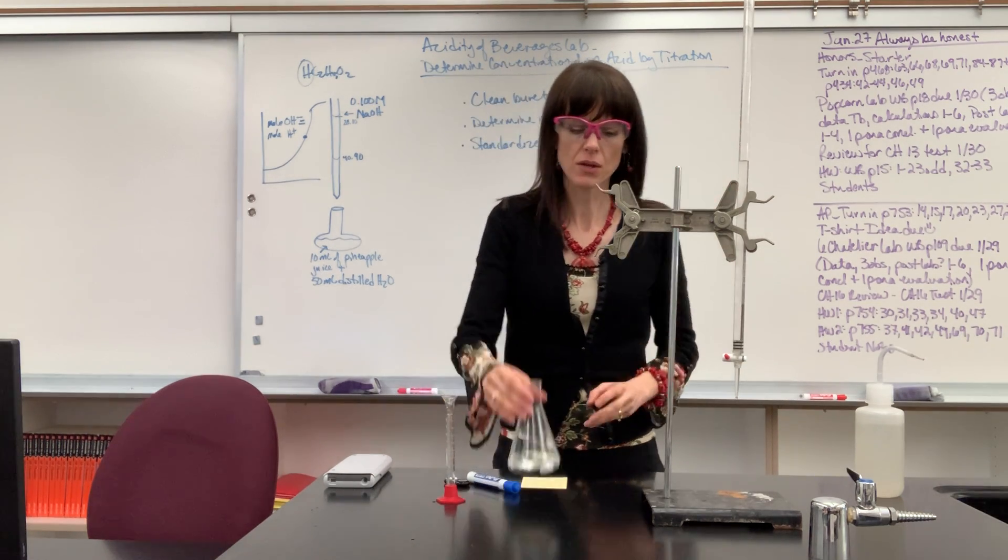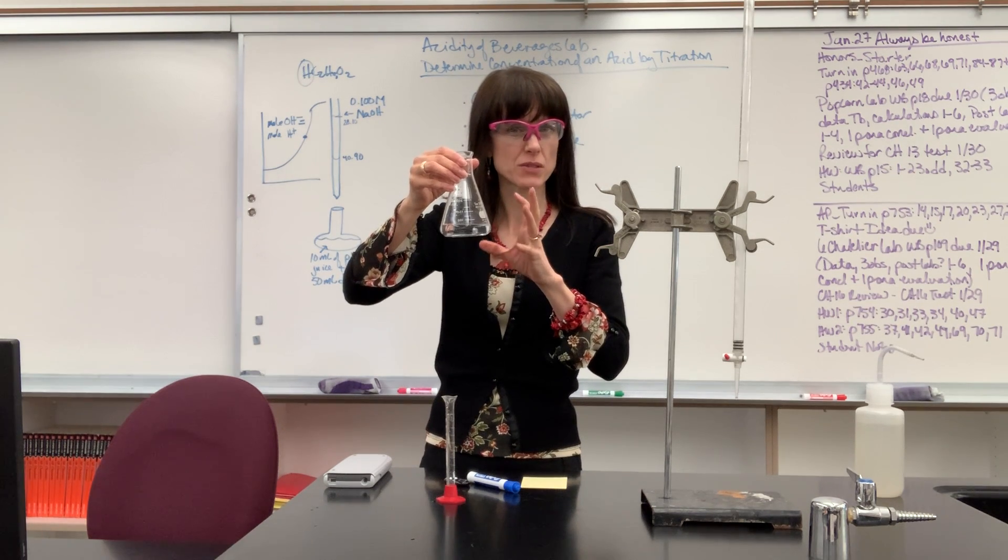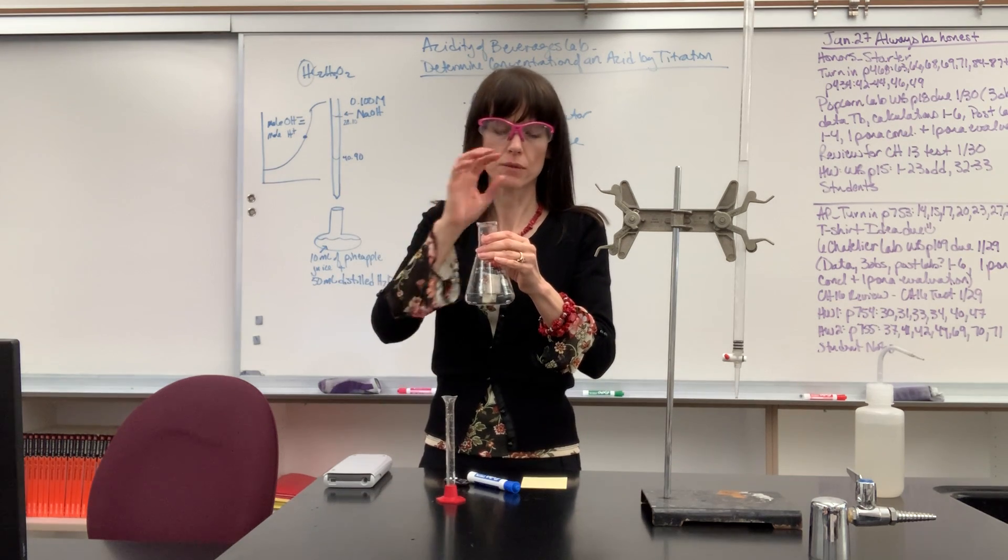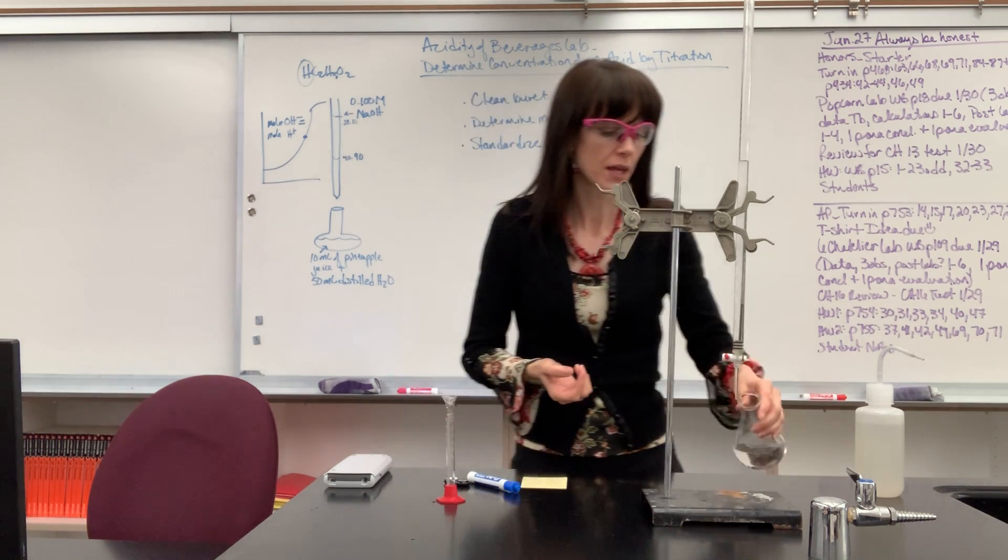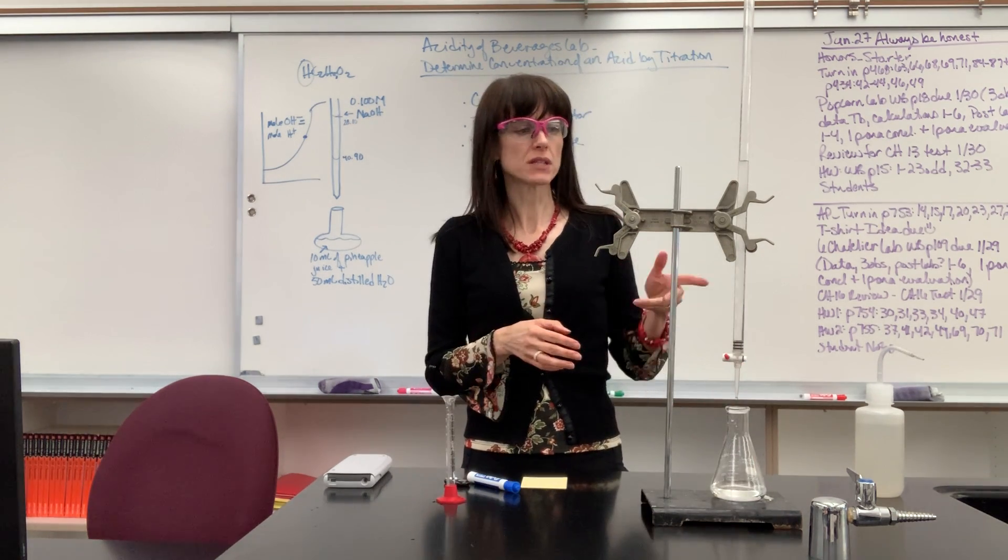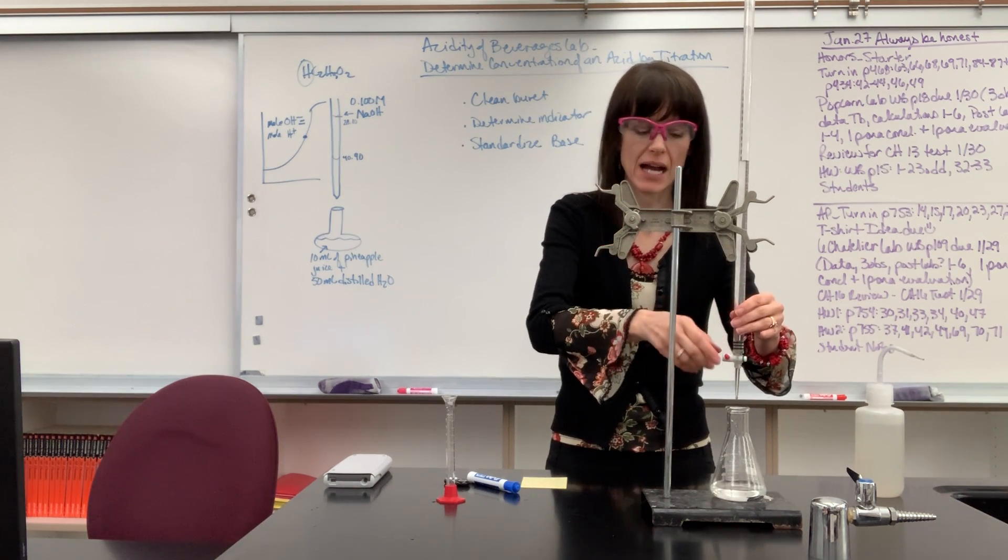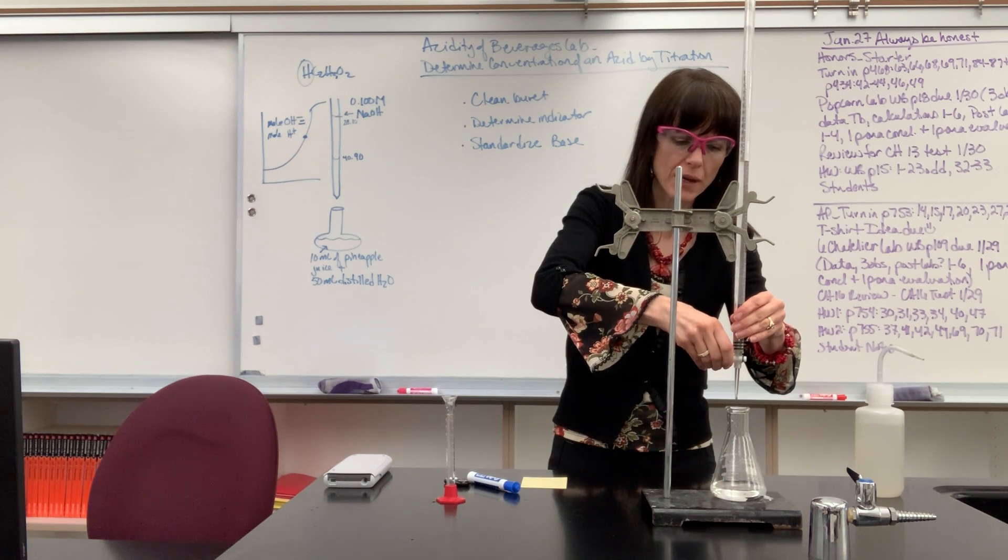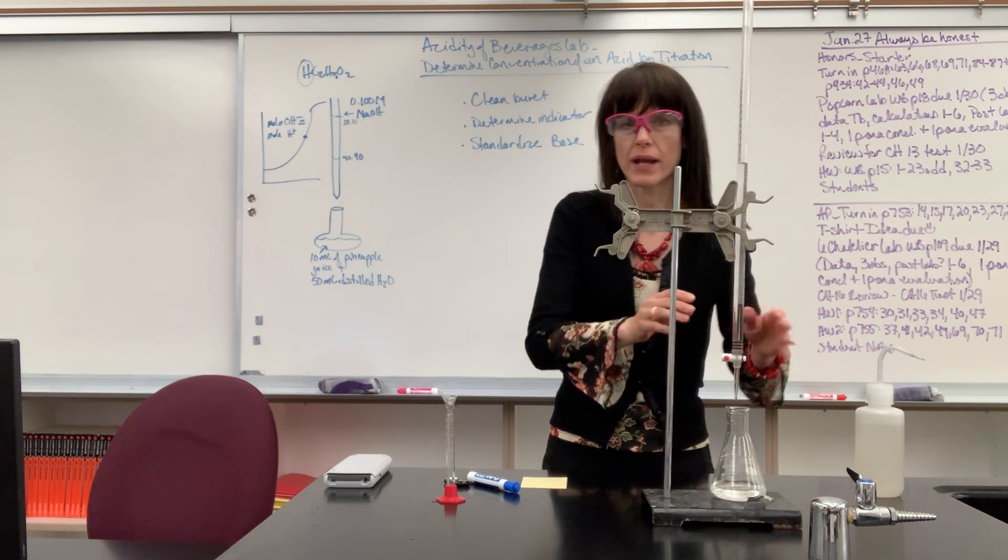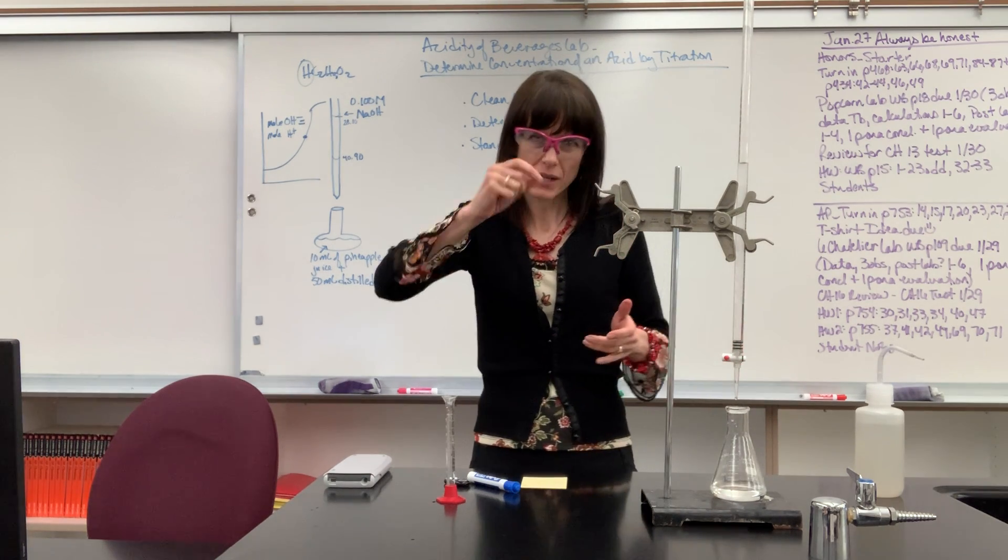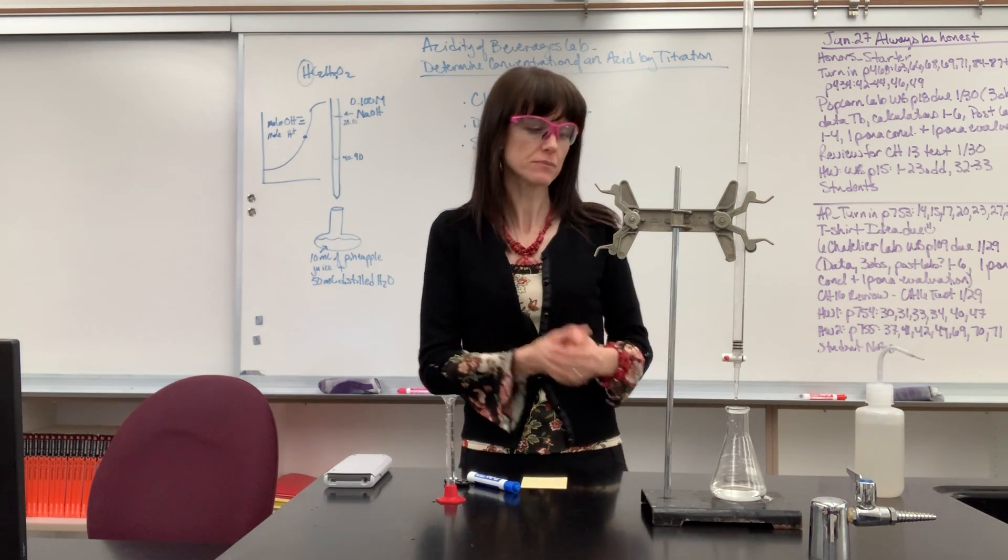So, after I've read this, I have my acid in here. I added a little bit of water with it so it's easier to see. I add my phenolphthalein. Put three drops phenolphthalein. It stays clear because this is still acidic. And then I begin my titration. Now, on the titration, if you haven't done titrations before, get a little junk beaker. Take 30 seconds and practice. This is very tactile. You want to get to the point where you can do this drop by drop, one drop at a time, or control it. I'm going drop, drop, drop, drop, stop it at any point that I want. So, you want to get that dexterity of the titration. It's very, like I said, hands-on, tactile.